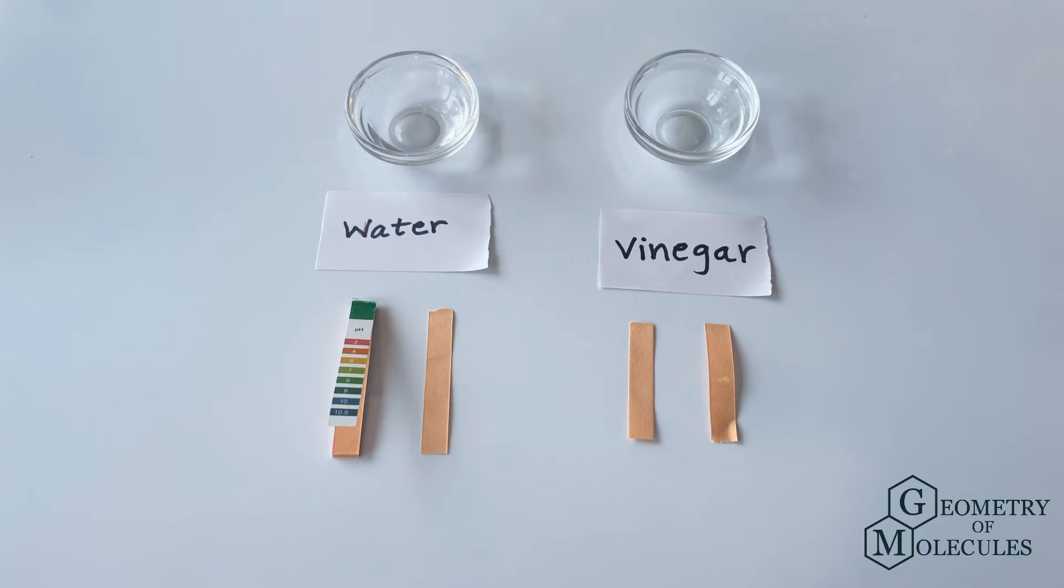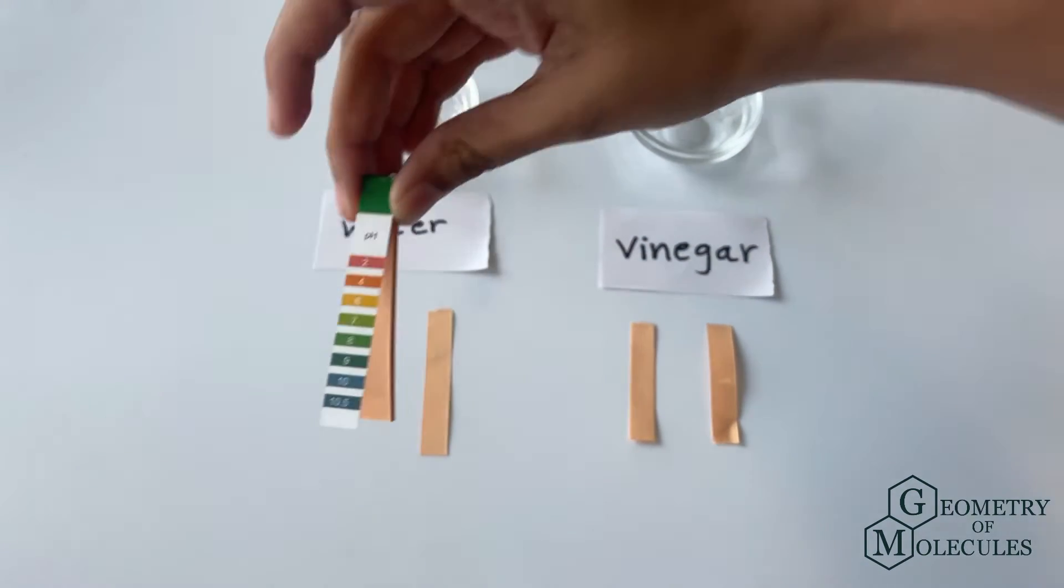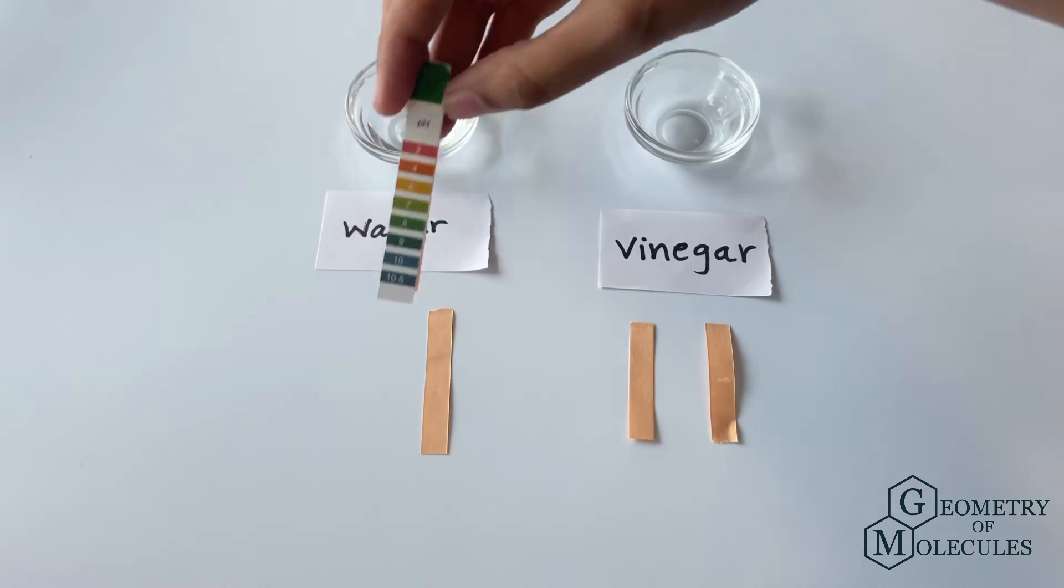But first, let us see what pH papers are and how to read the results. This is what a pH strip looks like, and based on the nature of our sample, the strip will change its color.